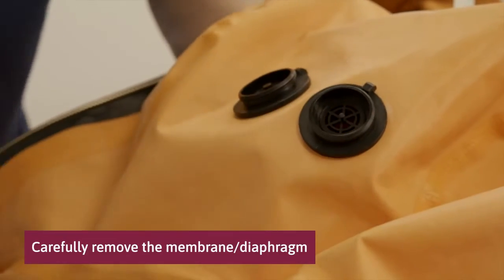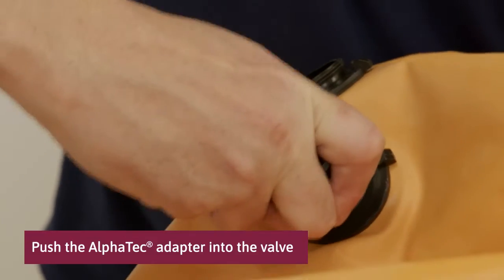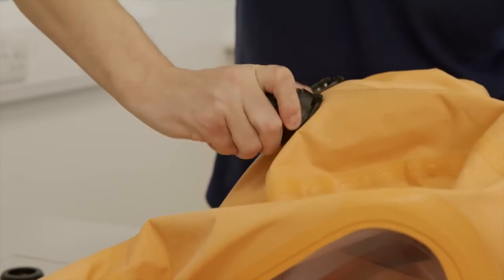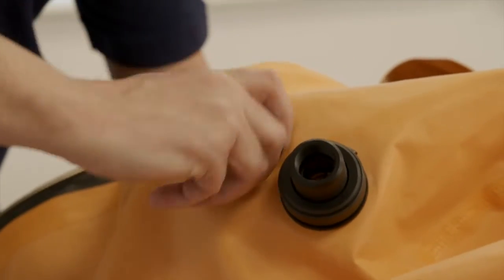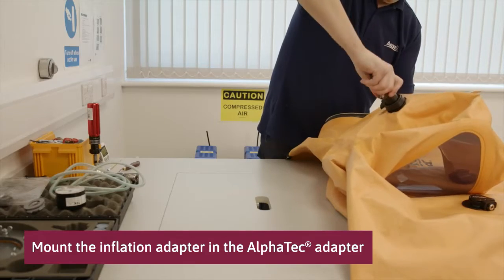Carefully remove the diaphragm in one of the exhaust valves. Push the Alphatech adapter into the valve and tighten the retaining collar. Plug the remaining exhaust valve. Mount the inflation adapter in the Alphatech adapter.